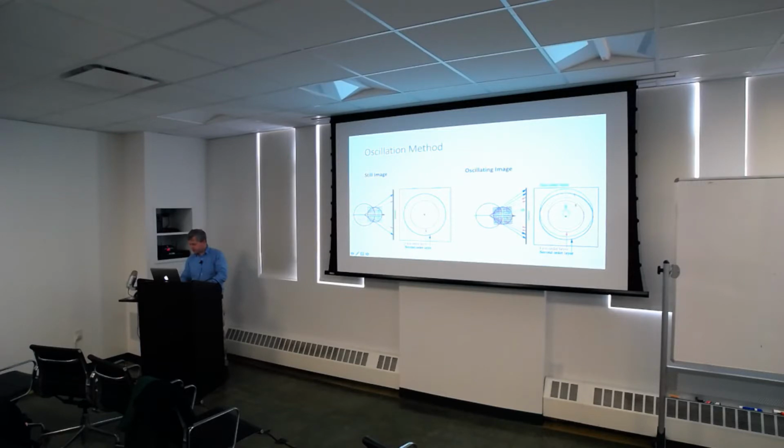So this is the original position in solid, and the moved position after you rotate the crystal is in dotted lines. If it's oscillated a little bit, you'll get diffraction spots all between these two things. These are what are called lunes, and this is actually what you collect. Because the sphere only interacts discretely, if you only image at very discrete angles, you might miss some diffraction spots. But if you oscillate it a little bit, you'll fill in all the space and get everything. So that's practically what is done in X-ray crystallography.